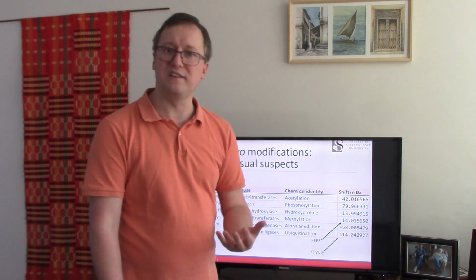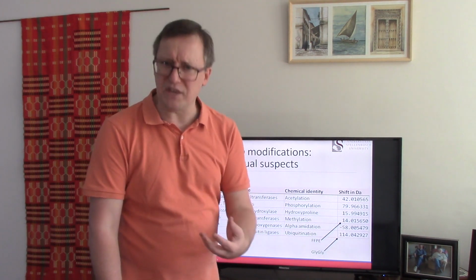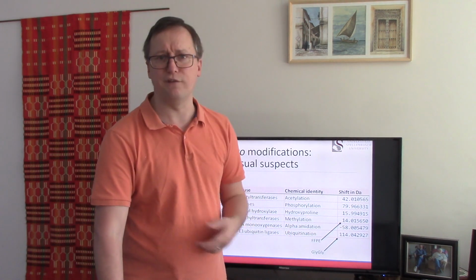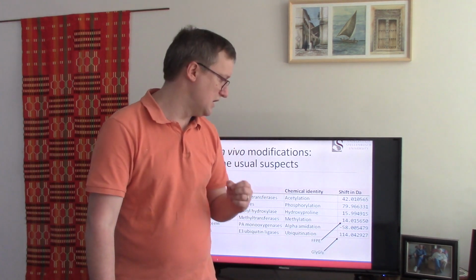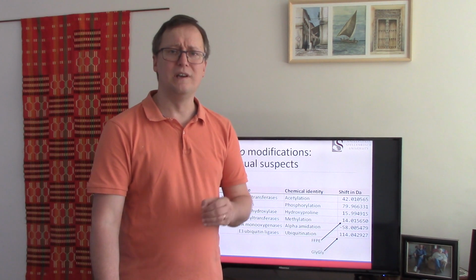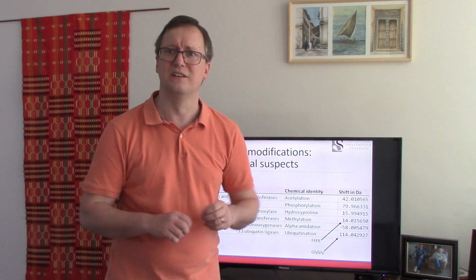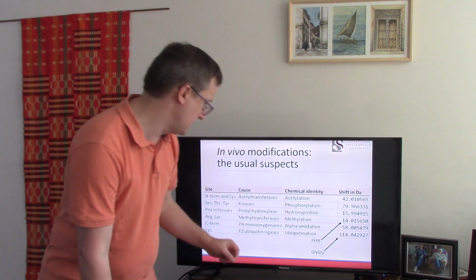One of the most obvious places to find methylation is on trypsin, because by methylating and dimethylating trypsin, we produce an enzyme that's more specific. So in a case like that, you're much more likely to find 14s or 28s that represent single or double methylations. But I would note that if you're dealing with formalin-fixed paraffin-embedded samples, it's very, very important that you look for methylation, because one of the key effects of the pickling process is to get lots and lots of methyl lysine. So be sure to look for that.